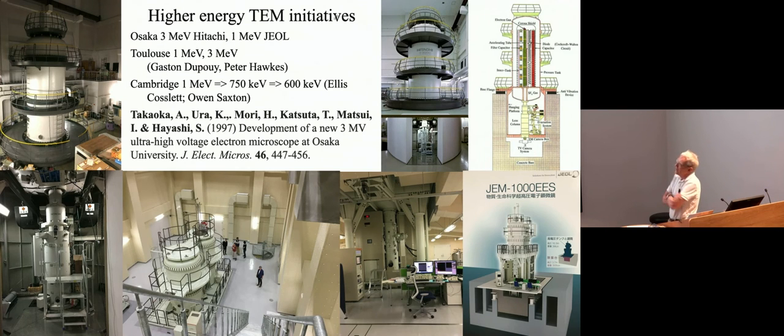And for many, many years, say 60s, 70s, 80s, quite a large number of people were keen on going to higher and higher voltage. I think they hadn't solved the image correction problem that you can do in a computer. They wanted penetration through thick specimens.